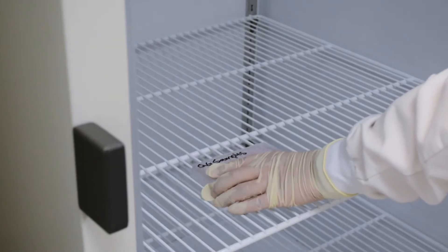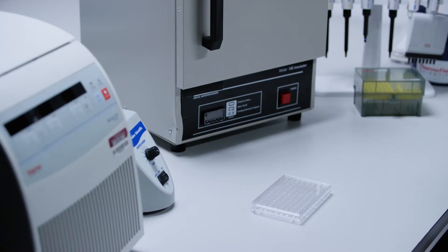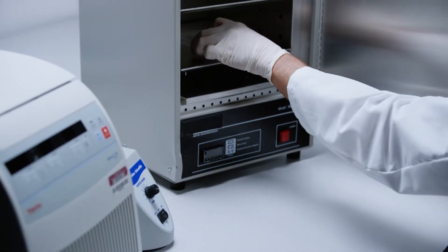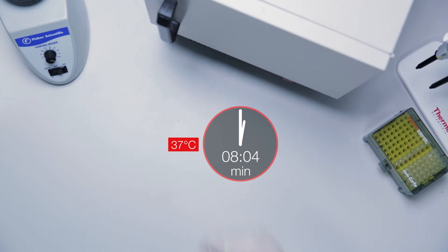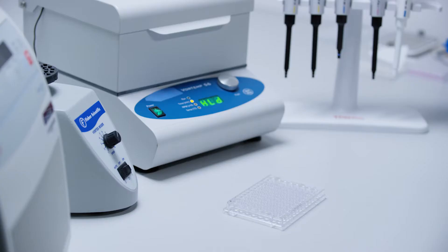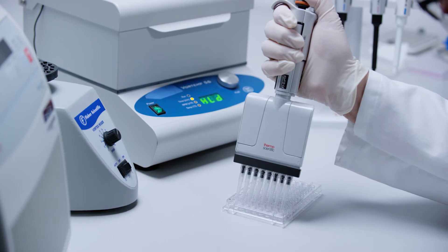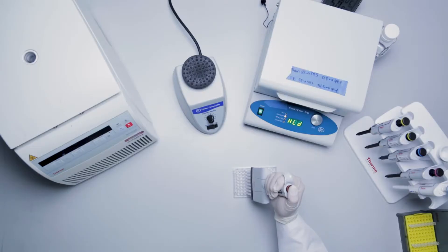If lysate samples are frozen, remove them from the freezer and thaw at room temperature. Incubate at 37 degrees Celsius for 30 minutes. Following incubation, vortex briefly if samples are in tubes or pipette up and down five times if samples are in plates. Make sure to change tips. Leave the samples at room temperature until use. Freshly made lysates should also be kept at room temperature following their preparation.